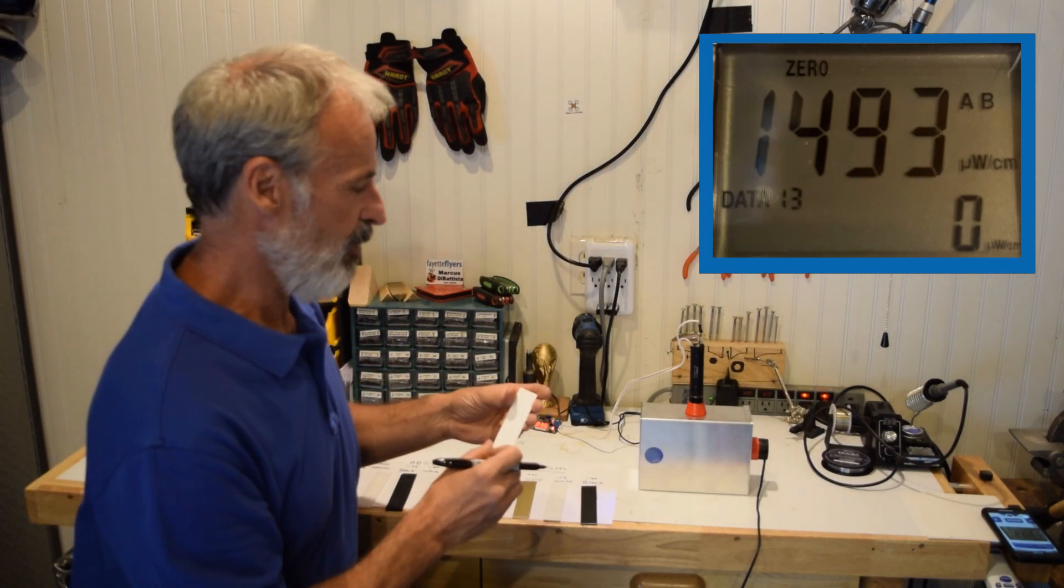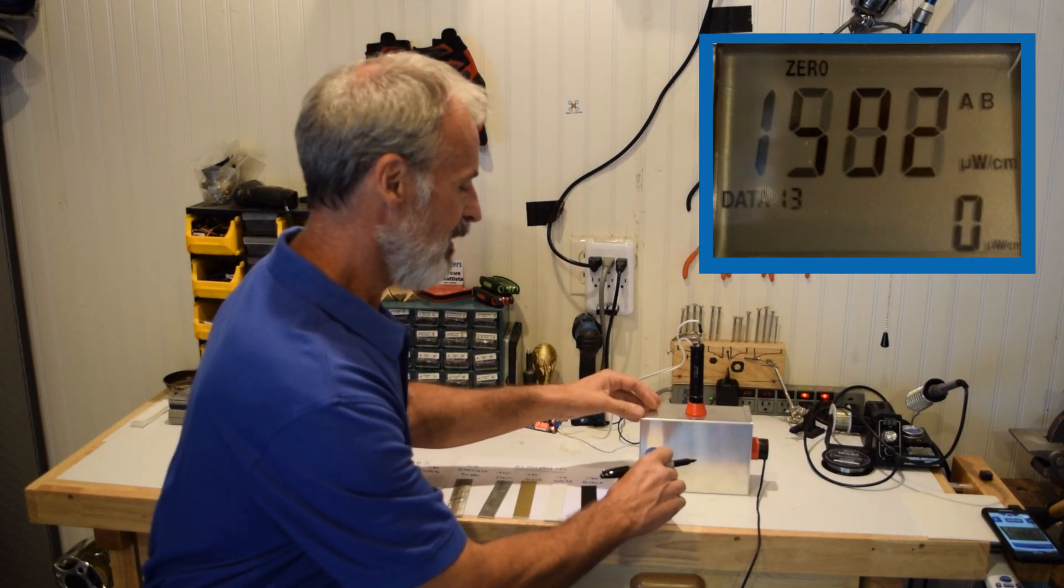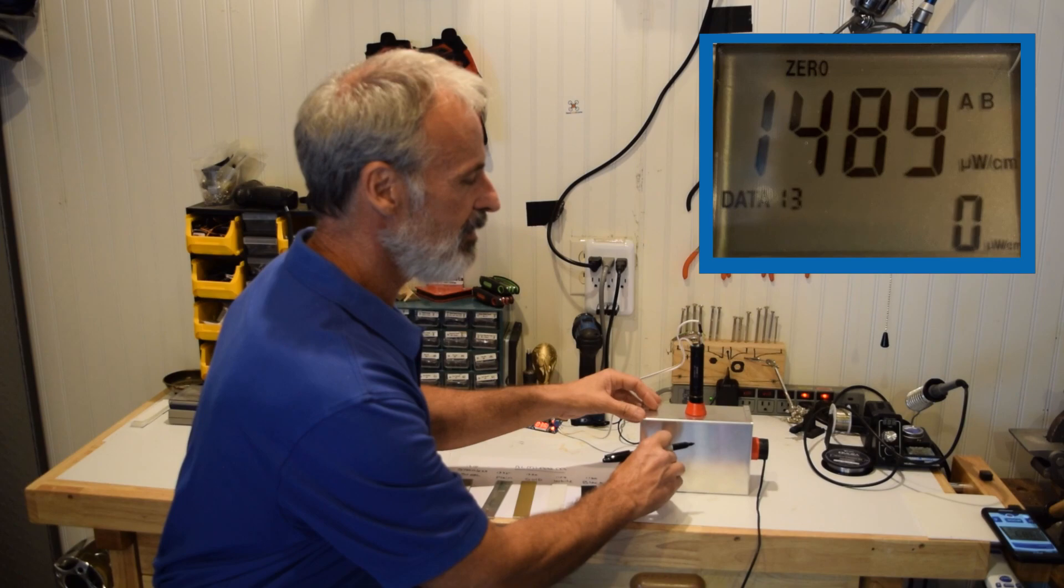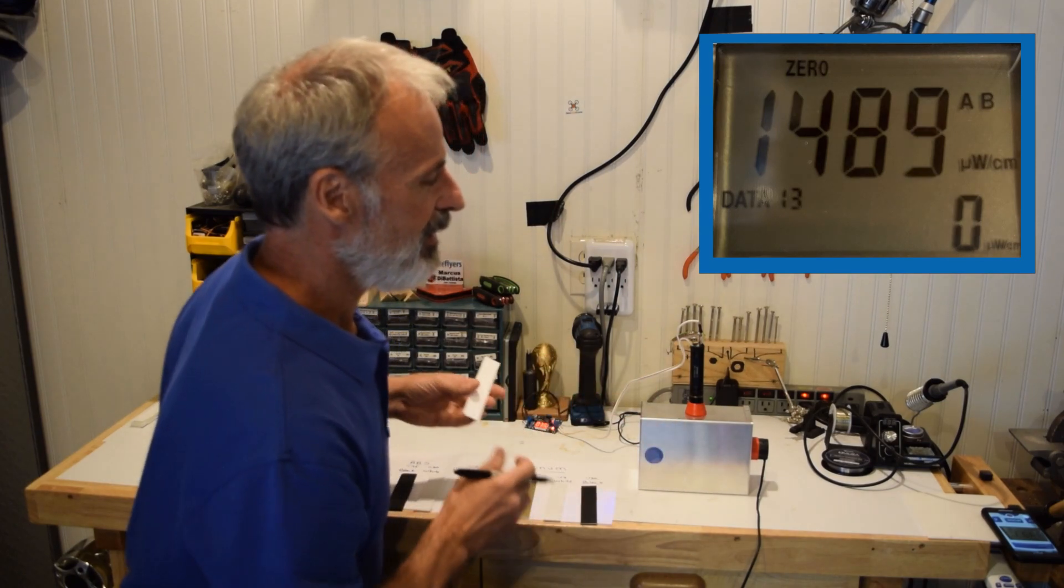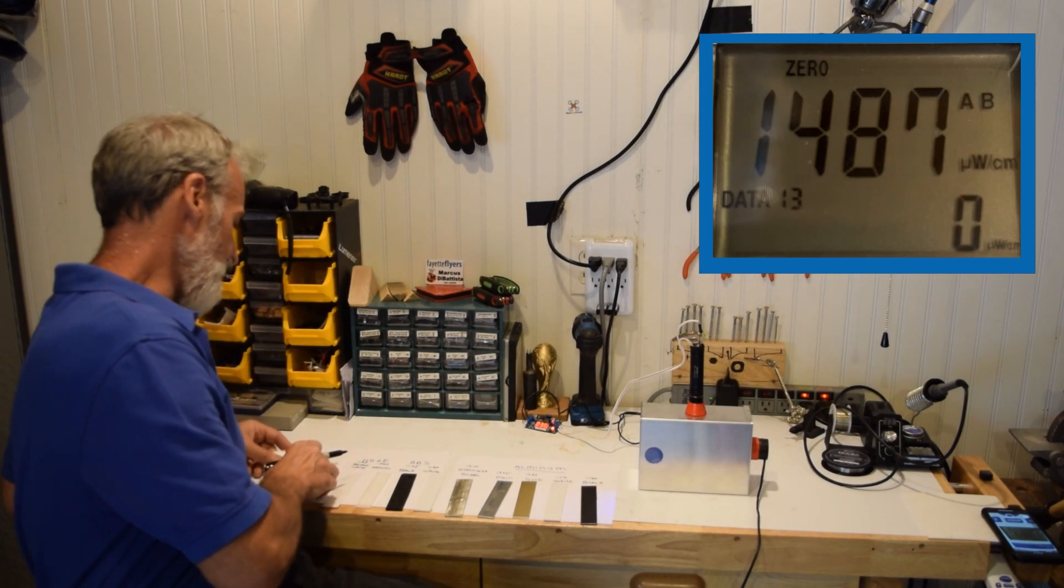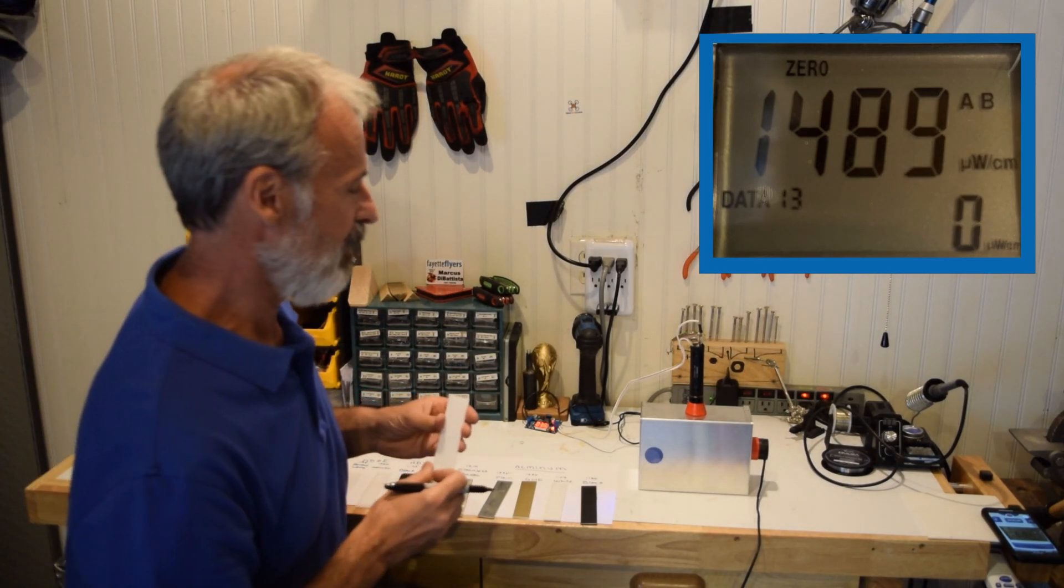Then of course, the Porex Vertec PTFE, which is 100% diffuse reflective. You can see 1,480. Basically no change. So almost nothing is being absorbed.